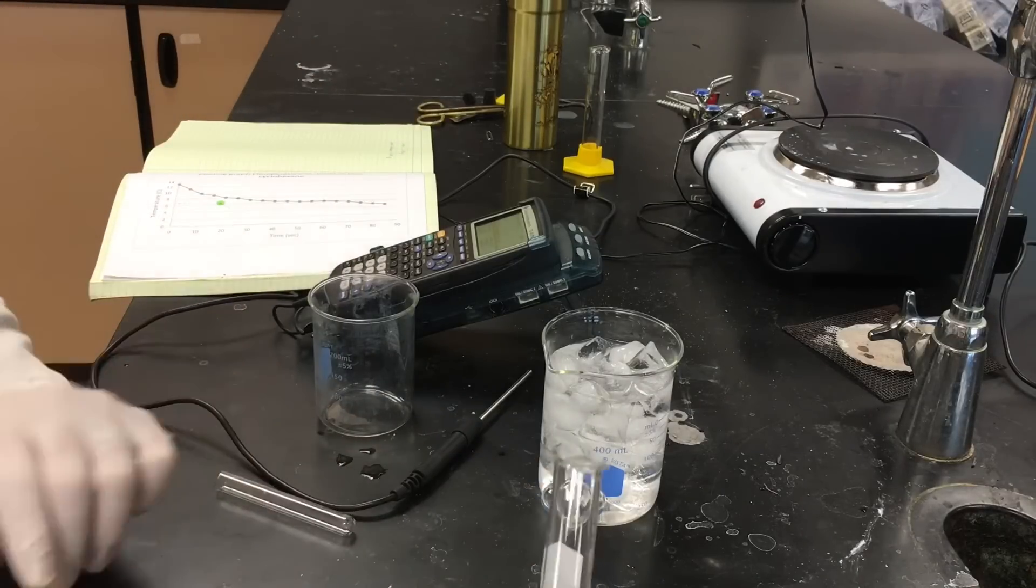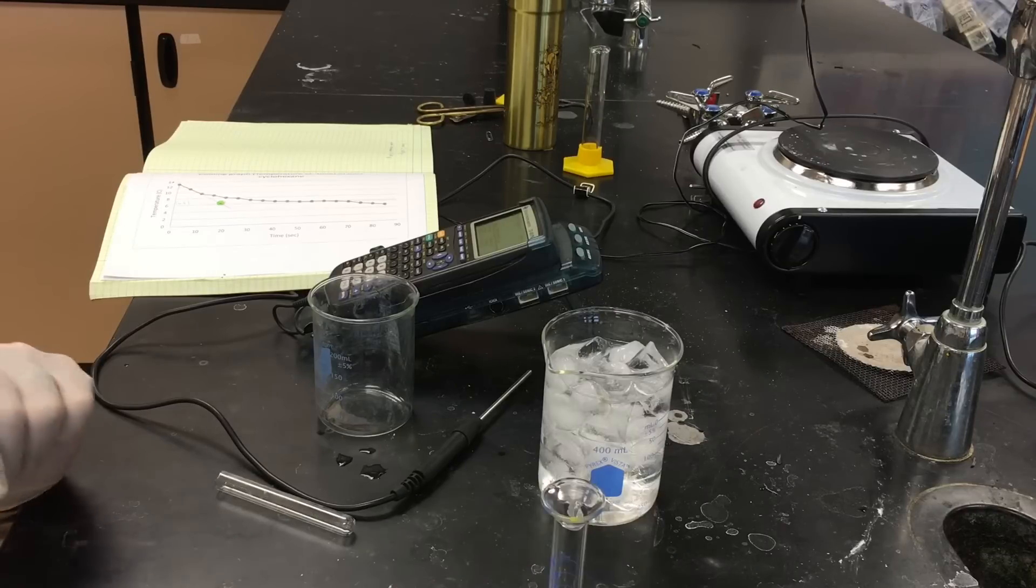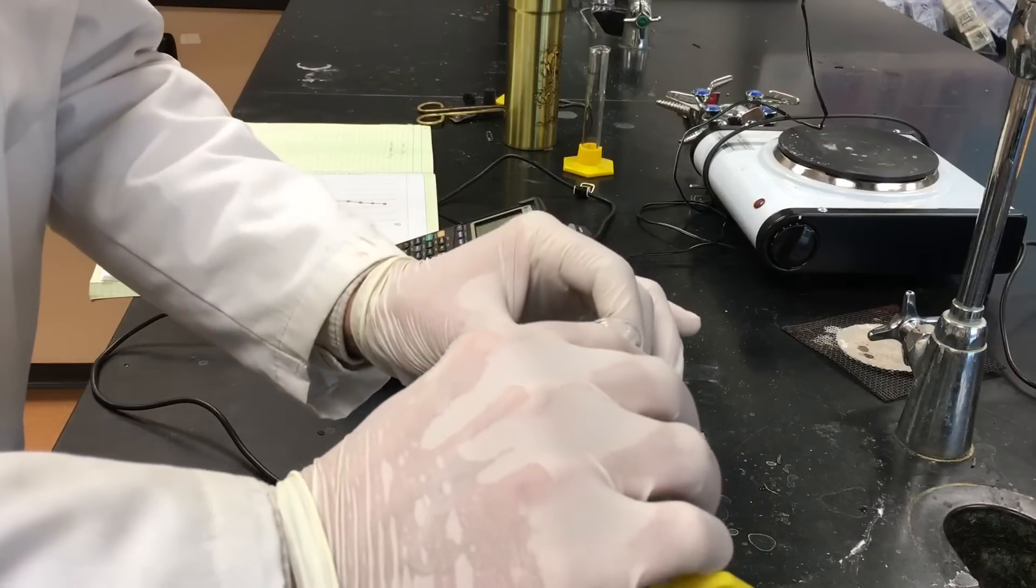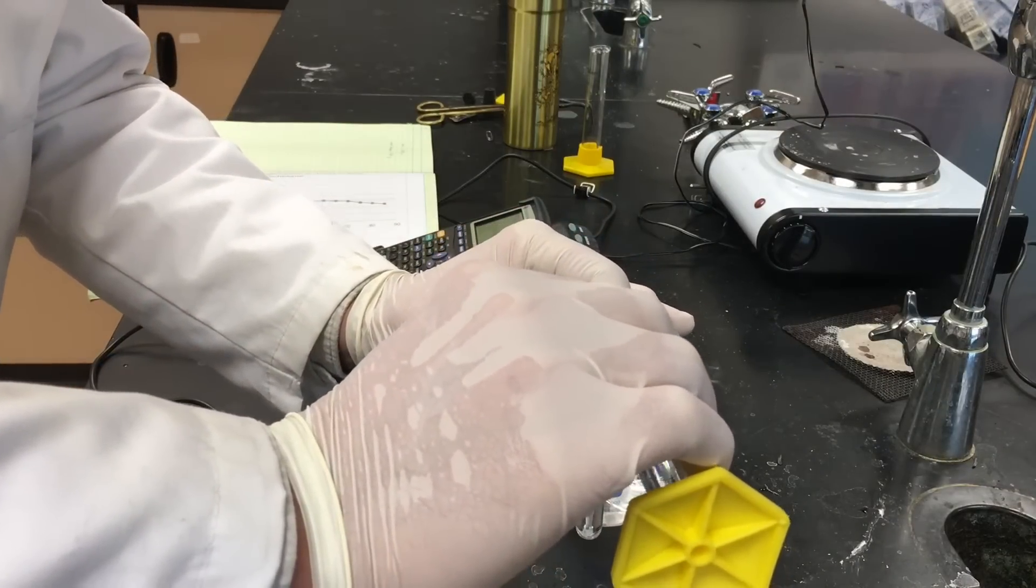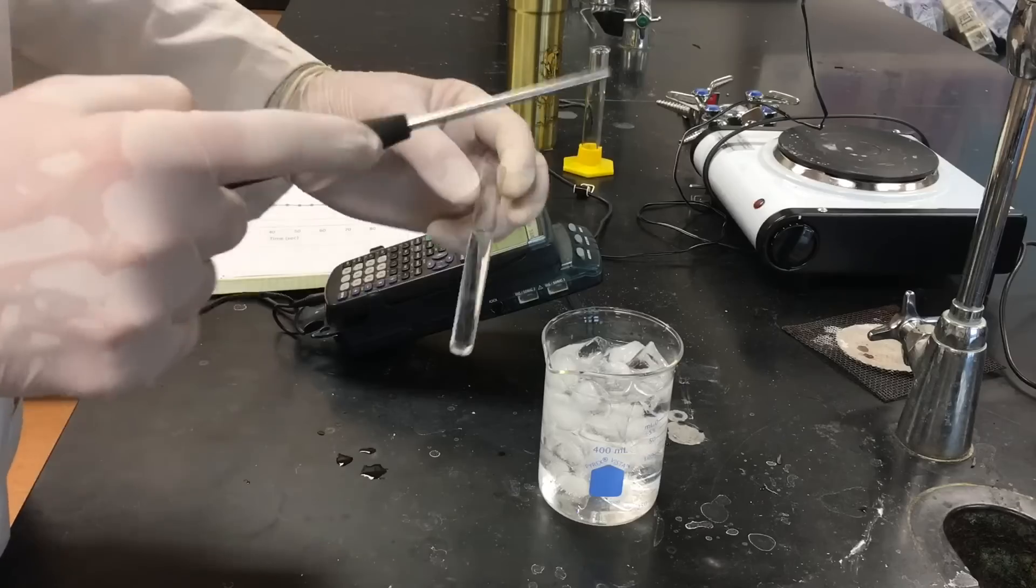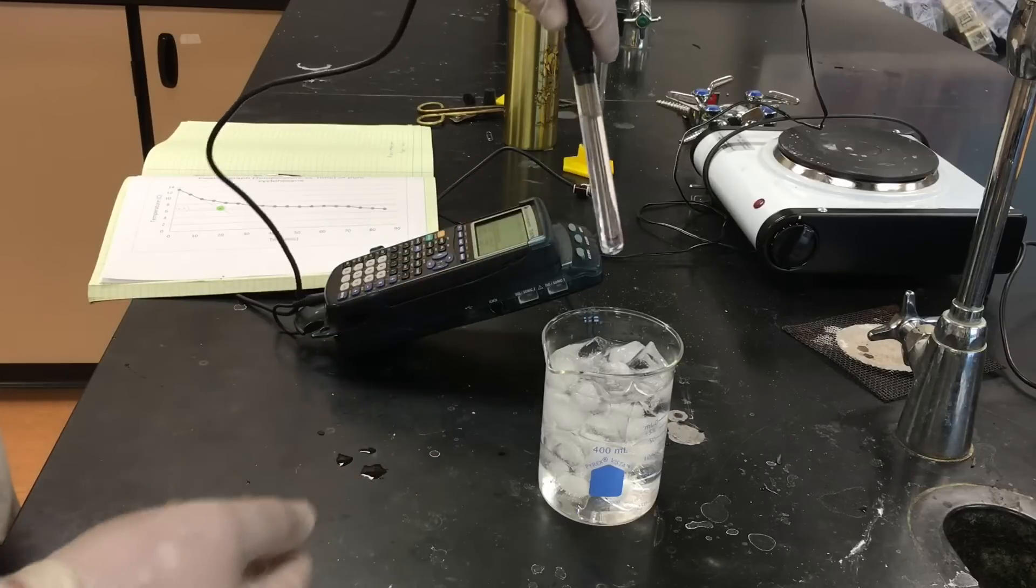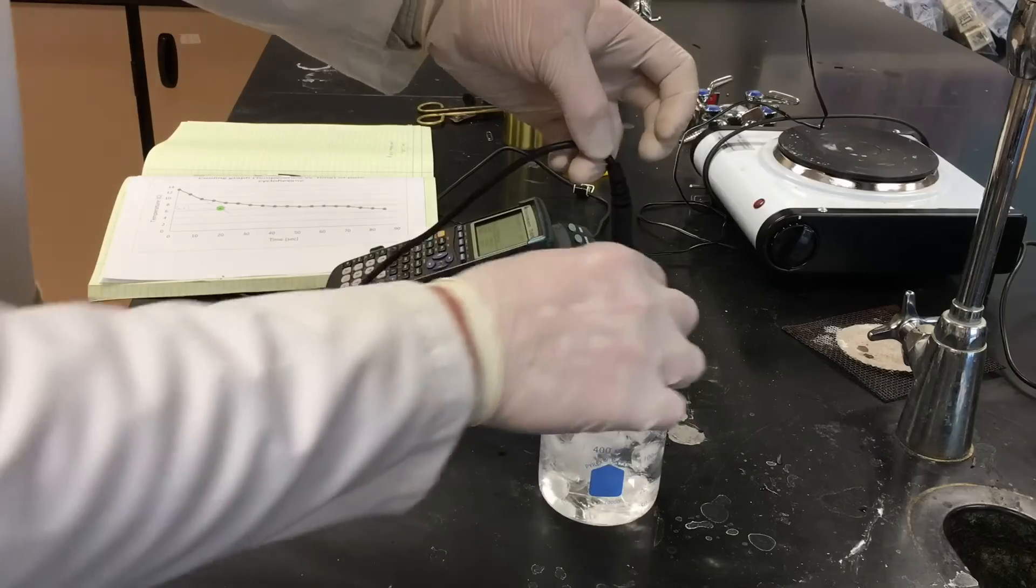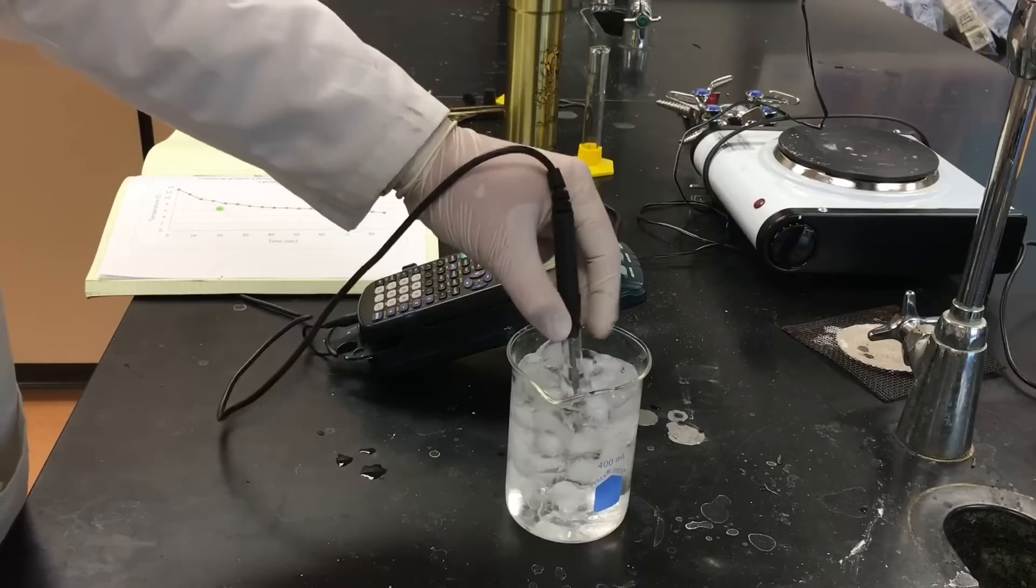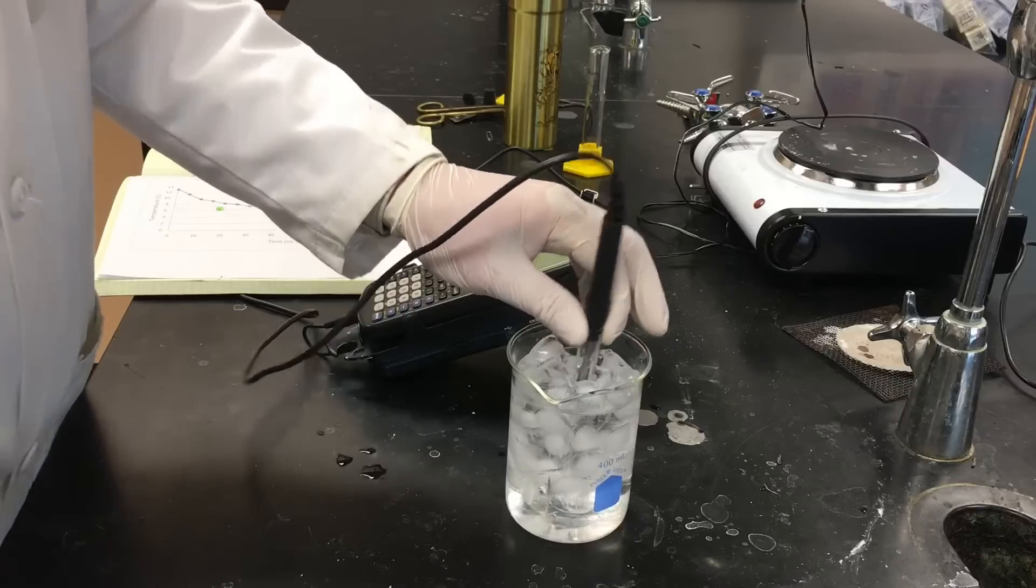We're gonna pour 5 milliliters again into a small mixing test tube. We're going to repeat the freezing of the solution exactly like we did when it was pure cyclohexane. We're gonna cool it to about 13 degrees and then take the temperature readings every 5 seconds.